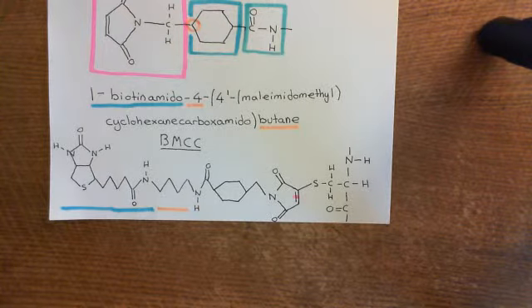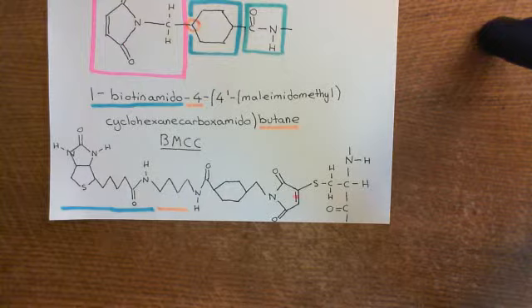Our first step was neutralizing the free cysteine residues within the proteins in our protein sample by binding N-ethylmaleimide to them. We then split our protein sample into two, a control and one that we were going to add hydroxylamine to.